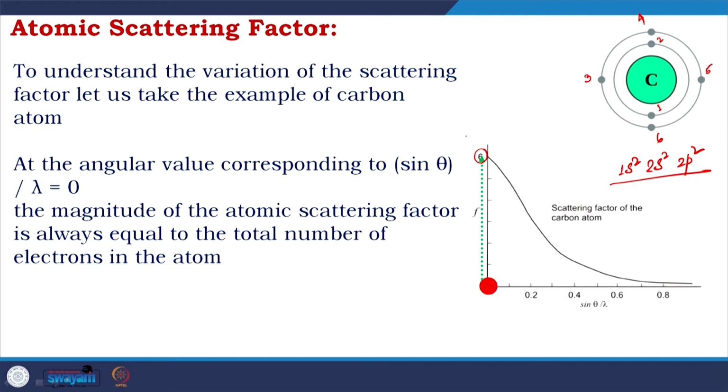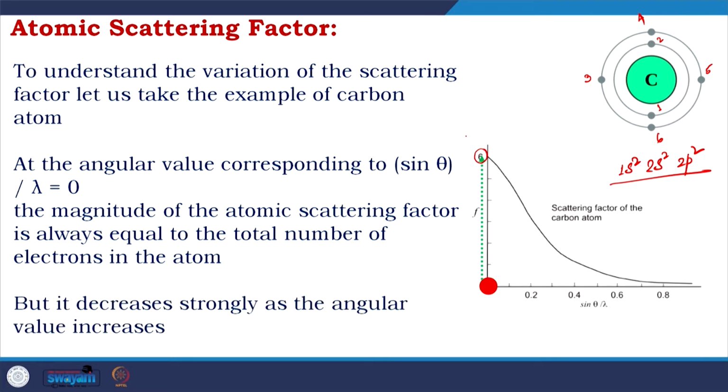But then as the angle changes, see how rapidly it is reduced. It decreases strongly as the angular value increases from 0 to 0.2, where it nearly reduces by half, and at 0.8 it is almost 0.